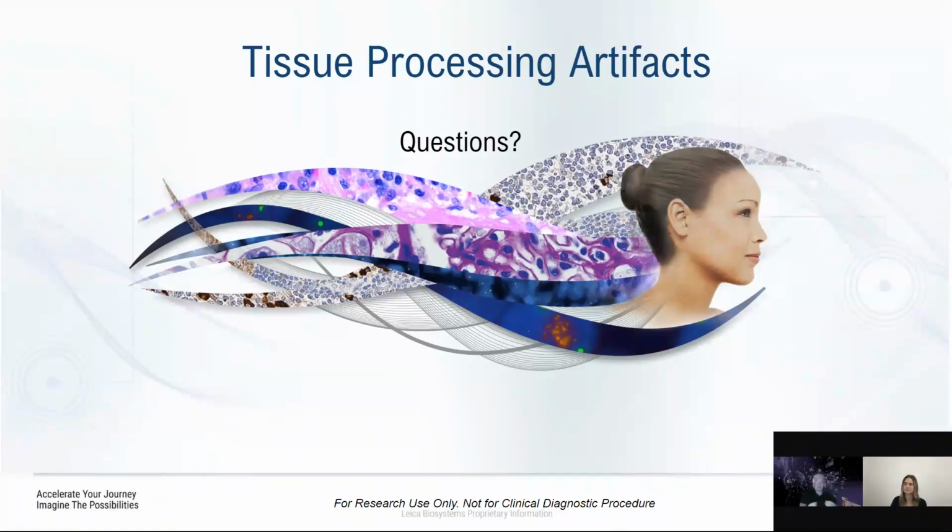A trick that we've used in the laboratory is that we would just do antigen retrieval, and it would release some of those cross links so that the hematoxylin would stain, and it brightens everything back up. If you're having trouble in your staining, once you've removed all of the wax and that seems to be a factor, make sure your reagents are fresh, they've been changed, and then look at the particular stain. Maybe the staining time is not long enough. Especially on hematoxylin, it can age over time.